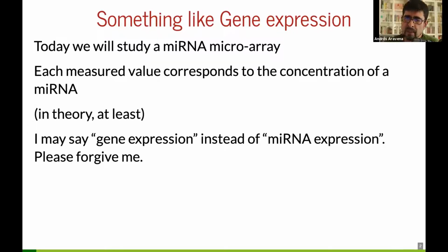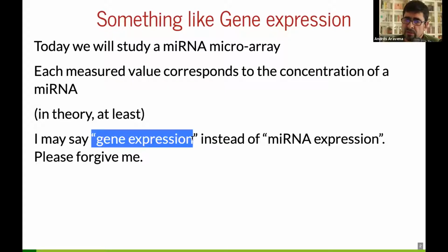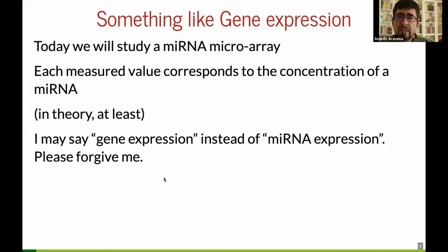Now, since I learned microarrays for gene expression, you will find me saying gene expression when I should say microRNA expression. In fact, I had an interesting conversation the other day with biologists; in my opinion, everything that is expressed is a gene, but apparently not everybody thinks the same, because not all genes are encoding, but they are still expressed. But anyway, whatever. So expression is concentration of something. I am not a biologist, so I may be wrong, probably wrong.